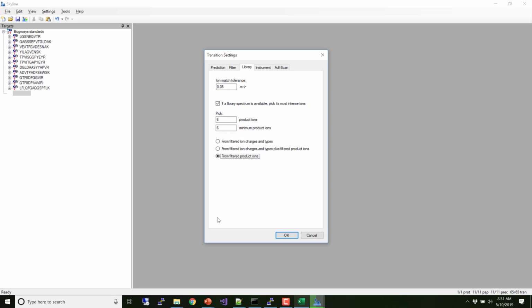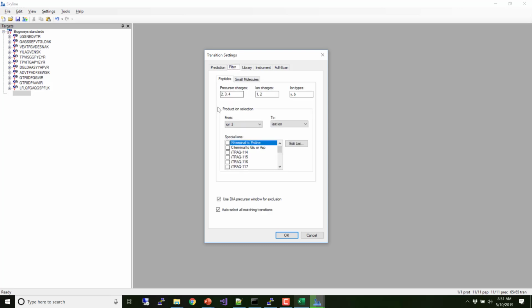So once you get done with your filtering, go back. Anybody need a review? Should we review those? Okay. Filter: 2, 3, 4, 1, 2, y, b, ion 3 to last ion, and no special ions. Does everybody look like that?